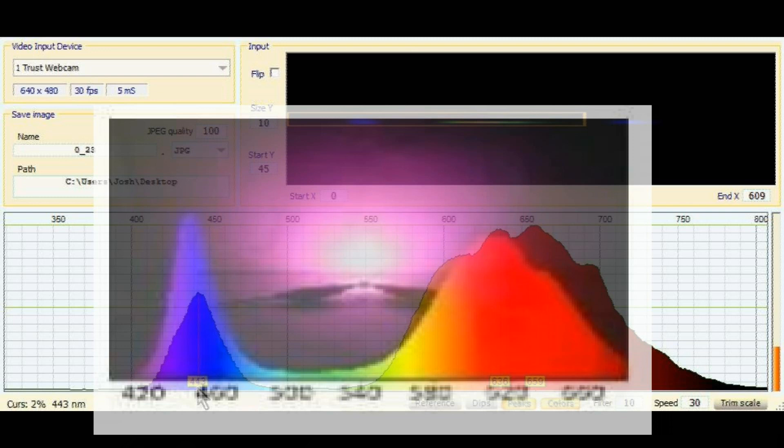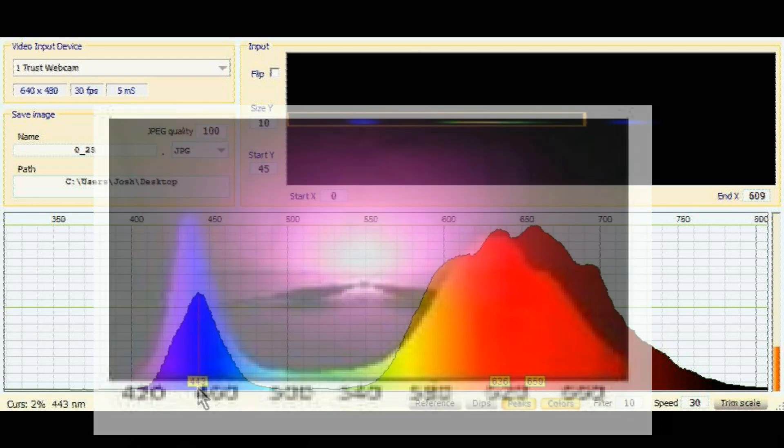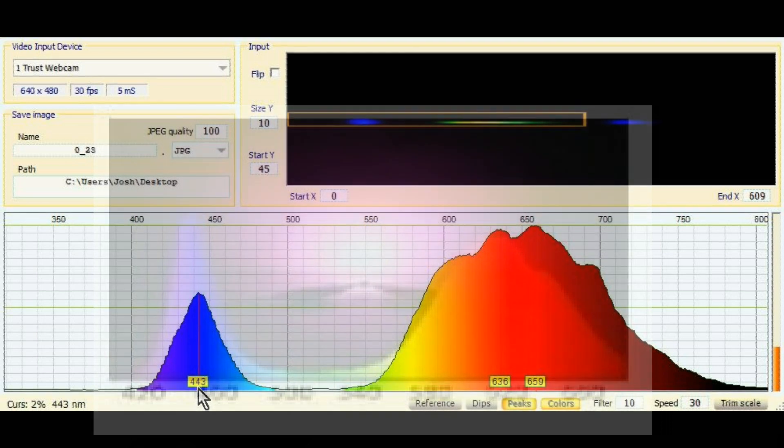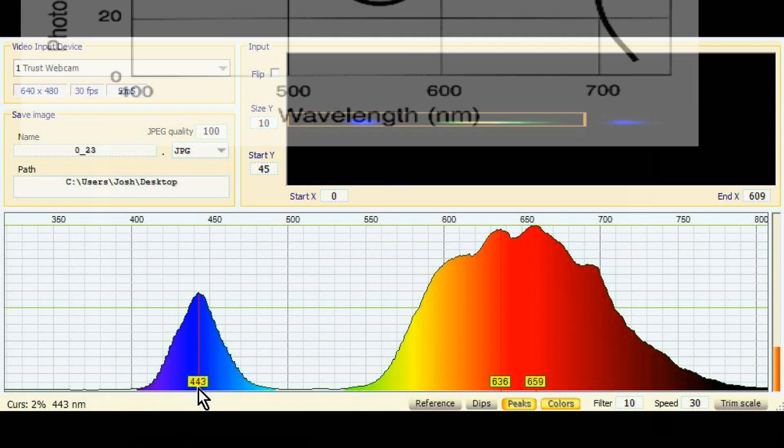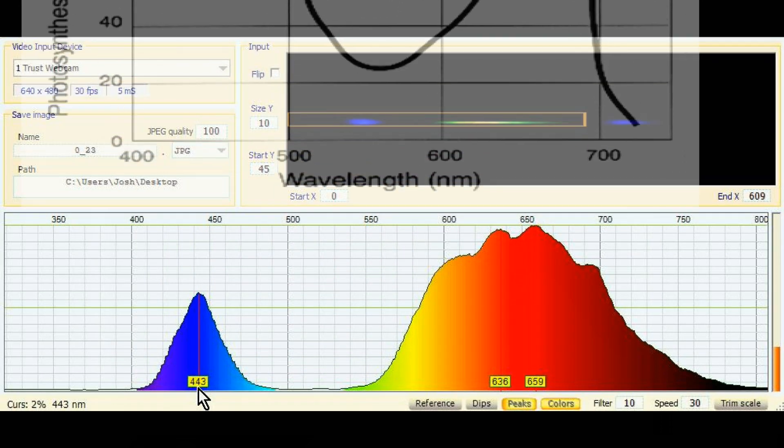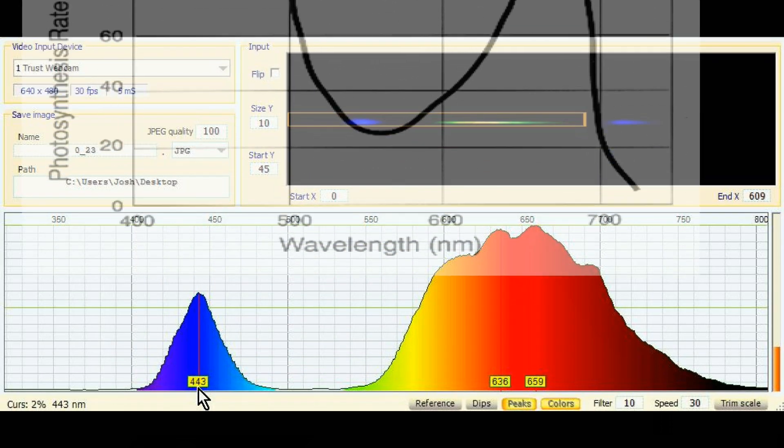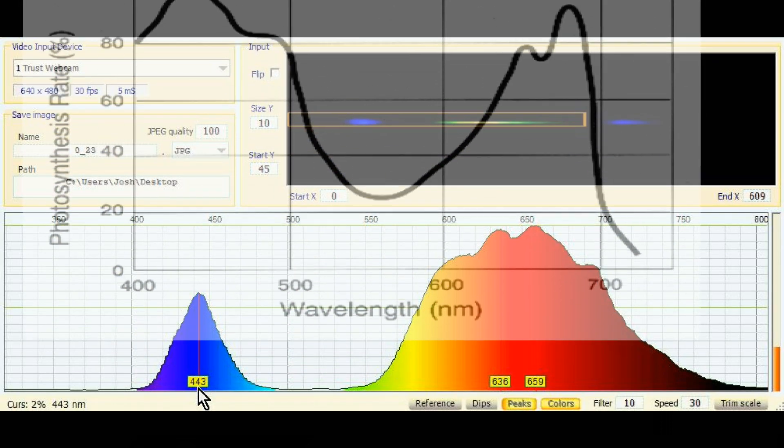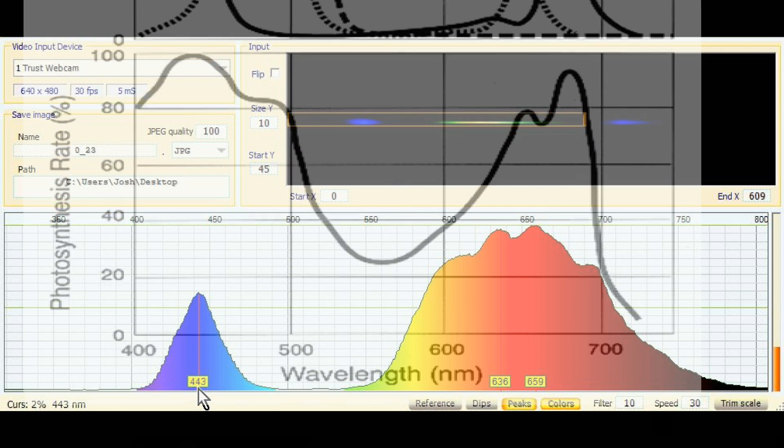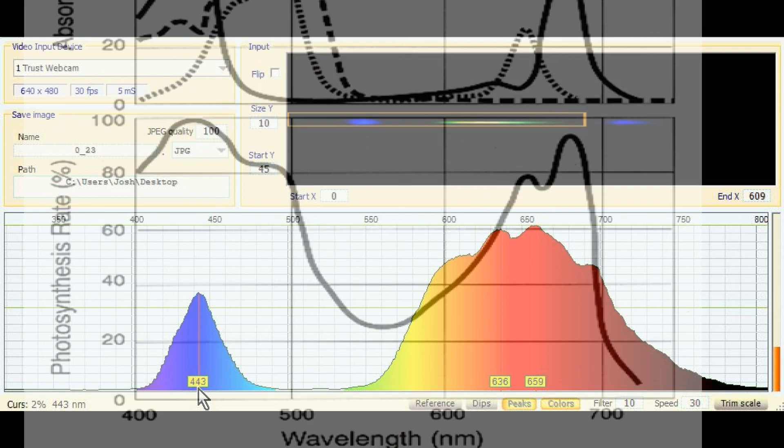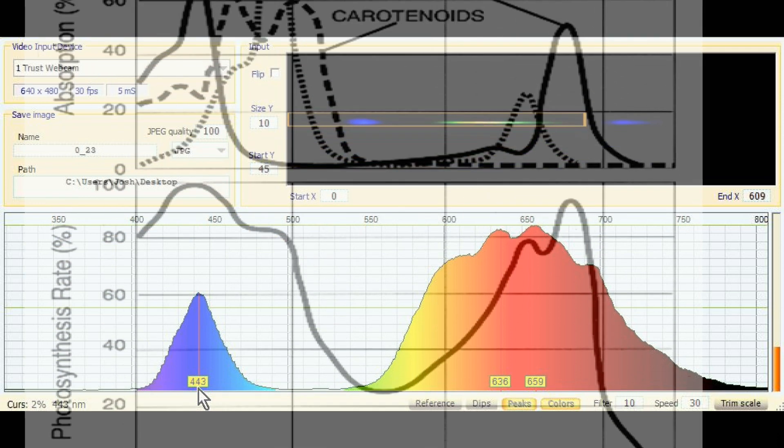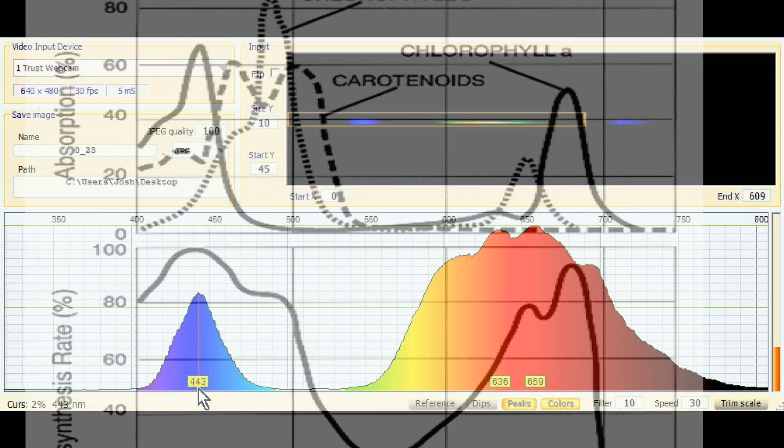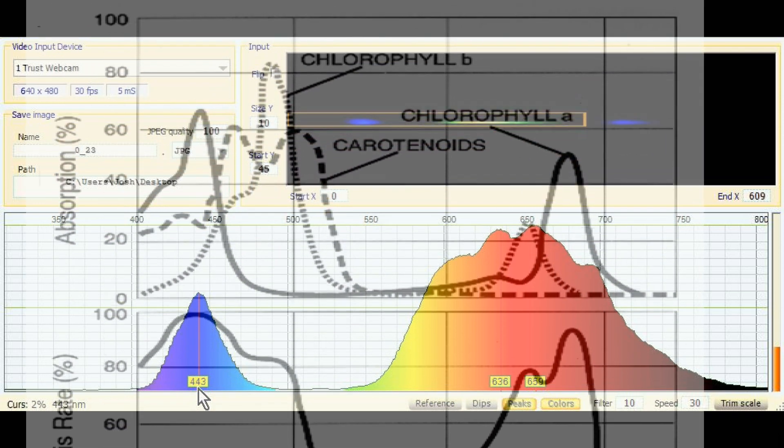My spectrum shows that the shift is more to the red than advertised to the tune of about 50 nanometers. Now let's compare the spectrum we measured against Wikipedia's graphs showing photosynthesis rates and absorption percentages.